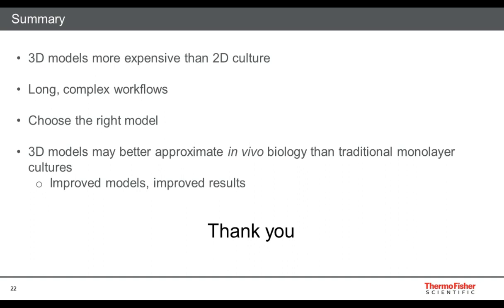How do you harvest or transfer spheroids from a 96-well U-bottom plate? The short answer is very carefully. So depending on how big your spheroid gets, it'd be pretty tedious to do this one well at a time, but some handheld things like disposable sterile transfer pipettes can be used to do that.